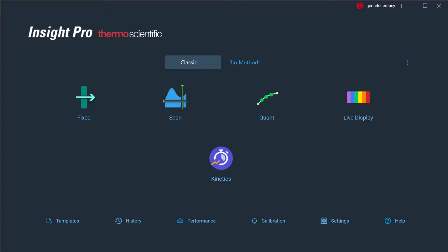Insight Pro software includes several experimental methods, including fixed, scan, quant, and kinetics. The collected data can be reported in a variety of formats, including absorbance, percent reflectance, and many others.